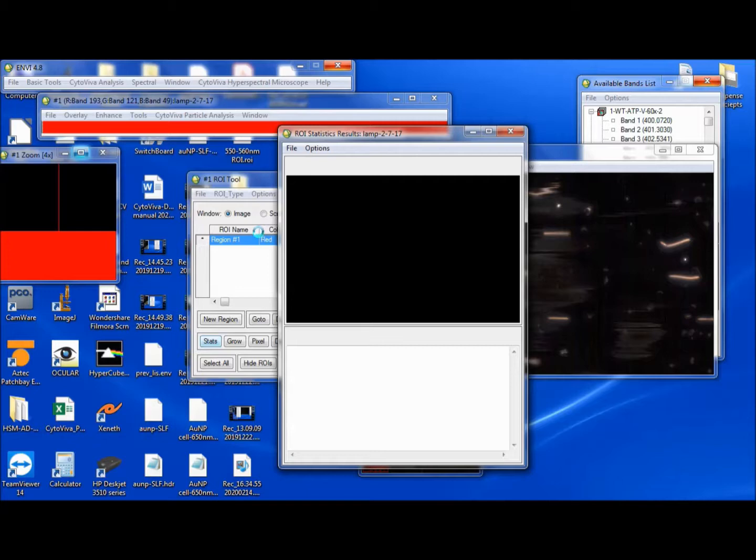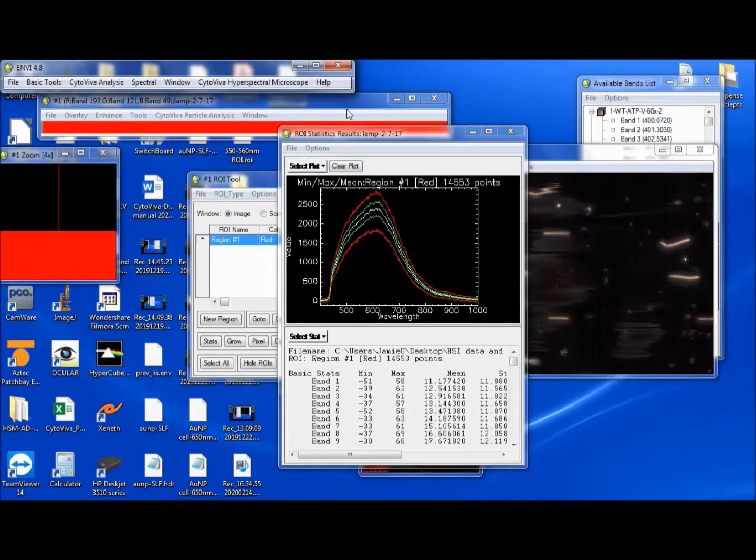We're going to take this mean spectrum of all these pixels, isolate this one spectrum, and do some spectral math on it to normalize it to a value of 1, because it's going to have, obviously, the mean intensity. It's always important when you do this scan to have some good signal. Anything over 1,000 is good. I think this was around 3,000. This should be fine. So this is still working here. It's a lot of pixels. Okay, it's finally done.